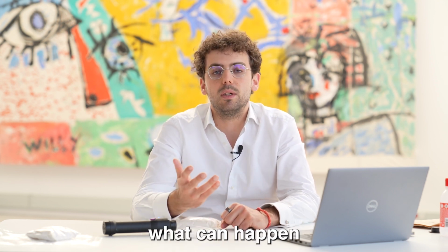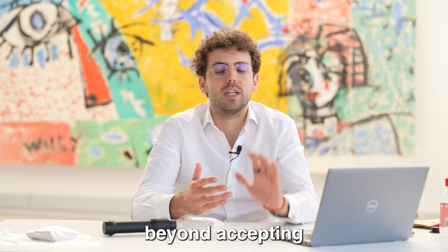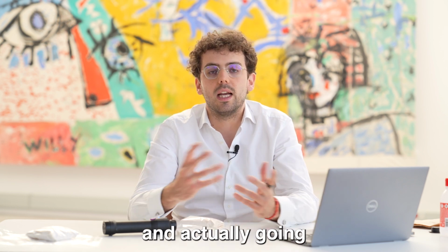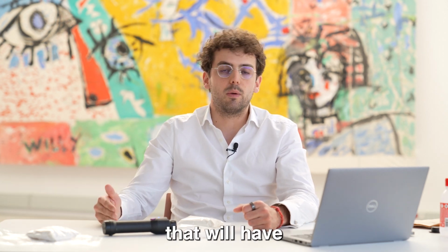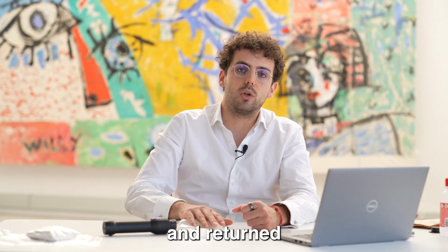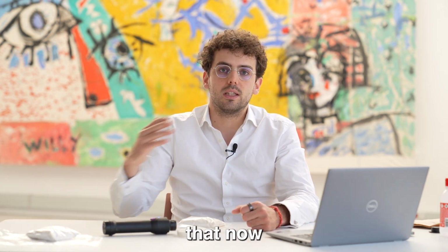You can imagine what can happen when you actually accept a sample like this, don't have any capability beyond accepting a certificate of analysis or a certain specification of a product, and actually going and putting that product into production. You will inevitably have an issue with the final product that you're supplying your customers, and of course, a claim might come that will have eventual exponential economic impact from something that could have been detected as a raw material and returned, rather than something that has now been blended and maybe even put into a final product that now comes with big economic consequences.